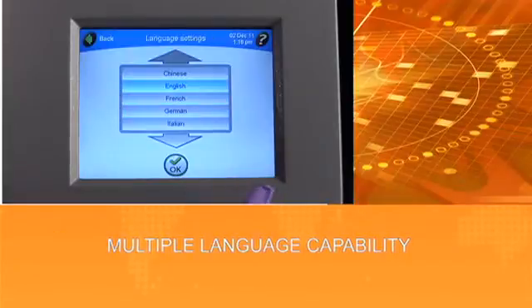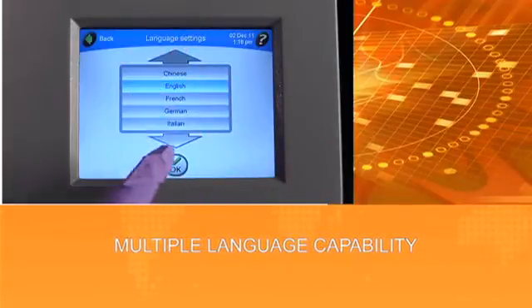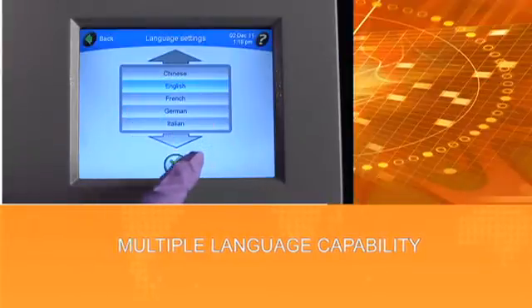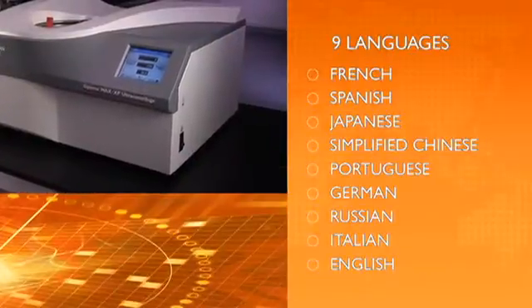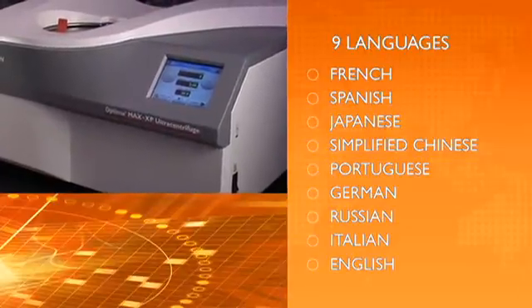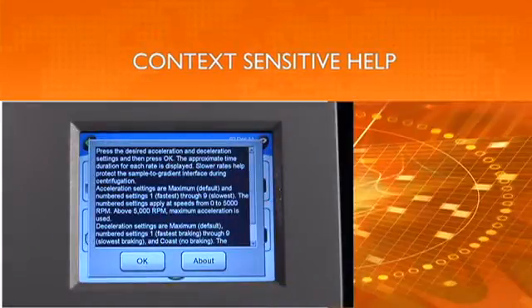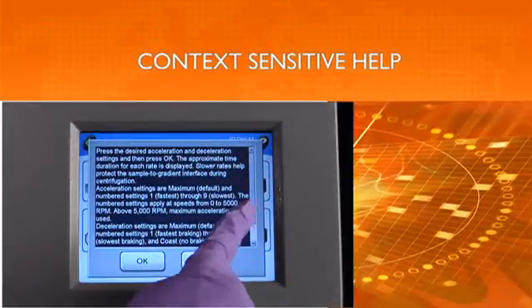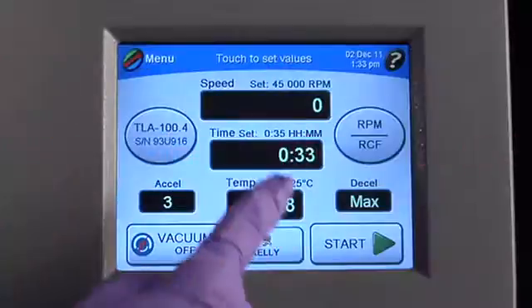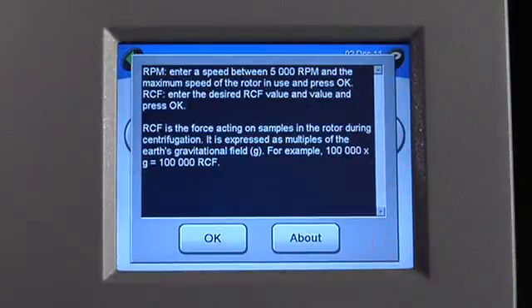The Optima Maxx series' ability to work in multiple languages enhances its value for labs around the world and helps reduce errors. The system operates in an array of languages, from French and Spanish to Japanese and simplified Chinese. The Optima Maxx series is designed to be intuitive. For help at any time, simply click on the question marks on-screen to launch information specific to the feature or function of the instrument about which you have questions.